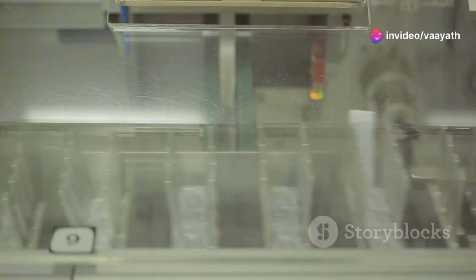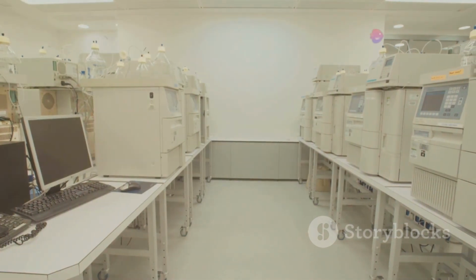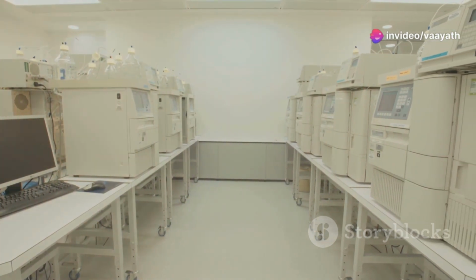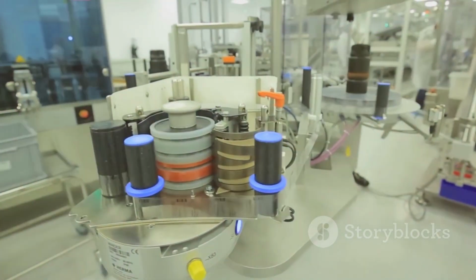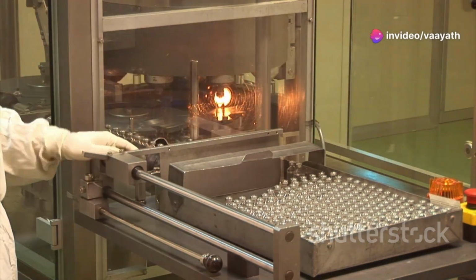Section 11. Conclusion: the enduring importance of media fill validation. In the realm of pharmaceutical manufacturing, sterility is non-negotiable. Media fill validation, though a complex and resource-intensive process, is an indispensable tool for ensuring the sterility of injectable medicines. It provides assurance to manufacturers, regulatory bodies, and most importantly, to patients, that the medicines they rely on are safe and free from harmful contaminants.